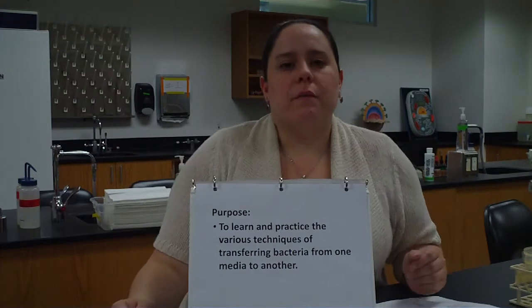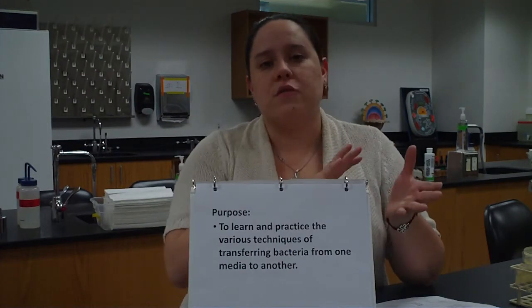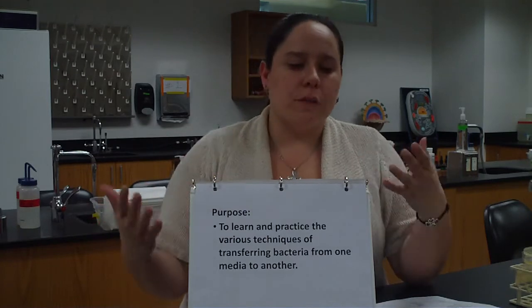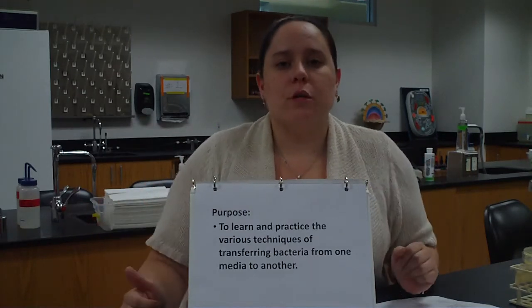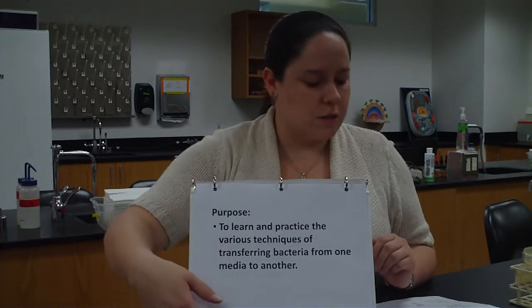The purpose of this lab is basically to learn and practice various techniques of moving bacteria from one piece of media to another. There are particular techniques that help us to see bacteria a little bit better, and to grow them in a particular way that works best for microbiologists.